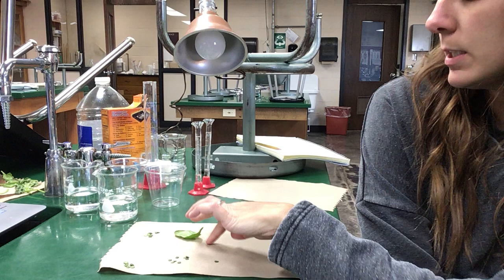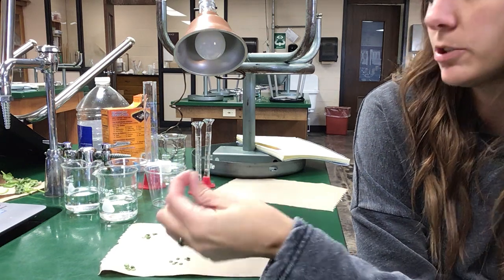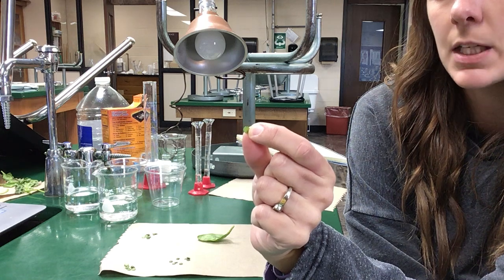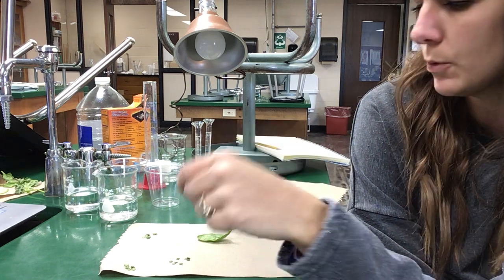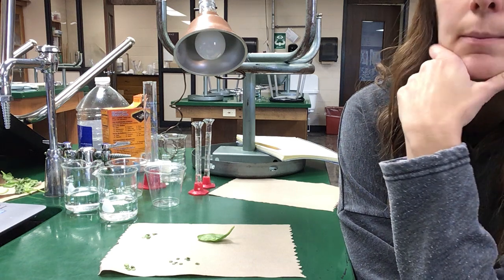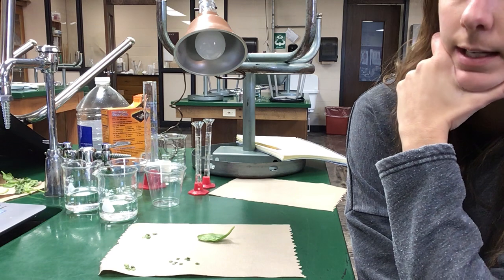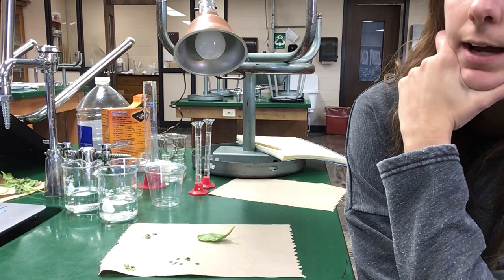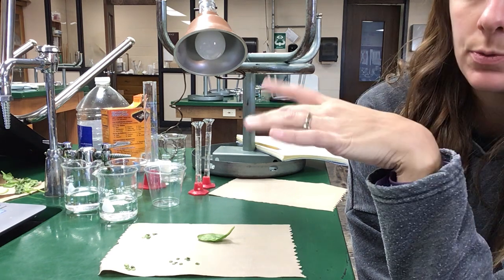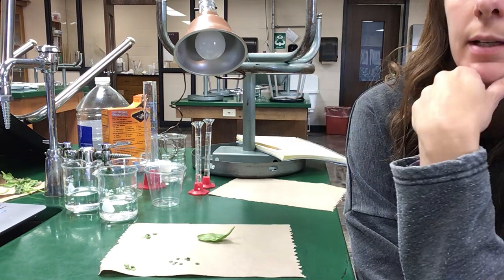So what we're using is spinach leaves, and these floating discs are made by hole punching these spinach leaves into pretty uniform shapes, what we call leaf discs. Leaves naturally have oxygen in spaces within the leaf, and that oxygen causes them to float in liquid.